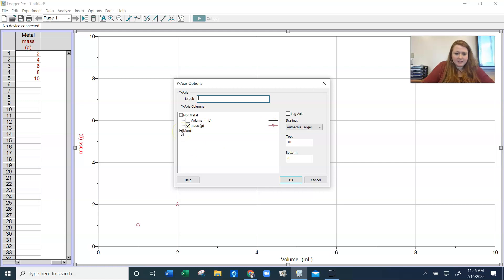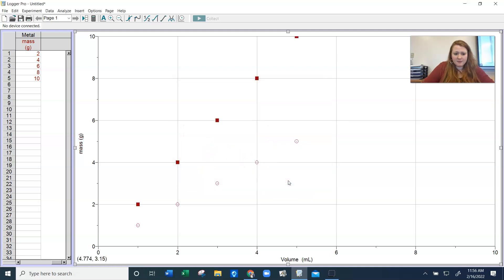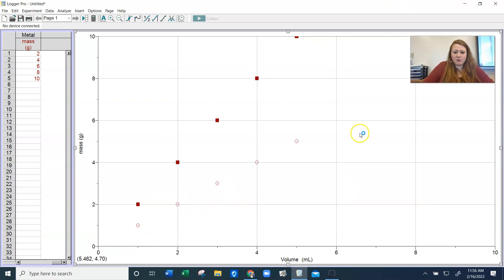If I click this plus, now I can tell it to also graph the mass of the metal. And I can say okay. Now I have two lines on the same graph, and that's what we want to see.